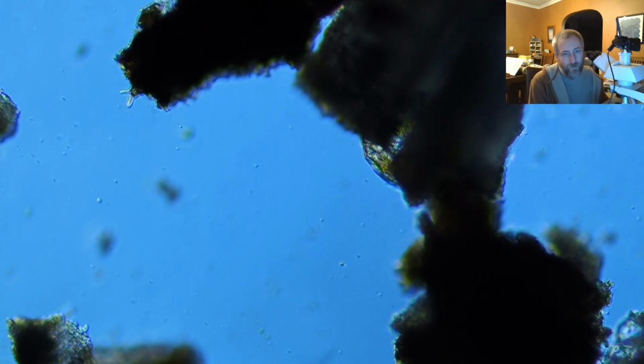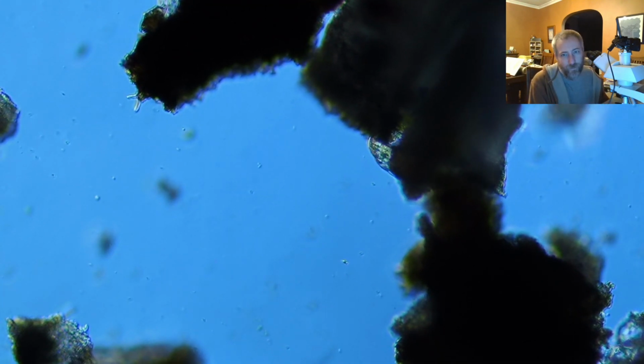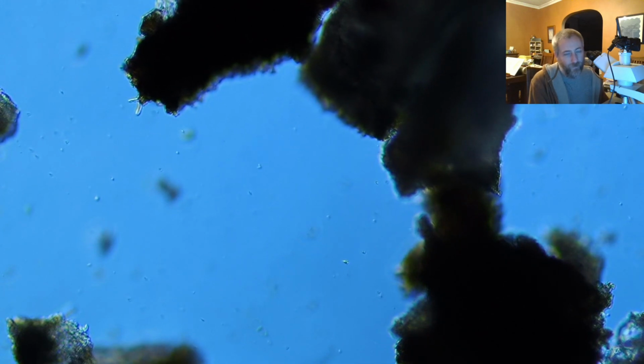So I haven't been talking about the water bear. I was talking about the rotifer for a little bit. There is a water bear right there. You can see him crawling. And by his movement and the claws on the end of his feet, you can tell that it's a water bear.